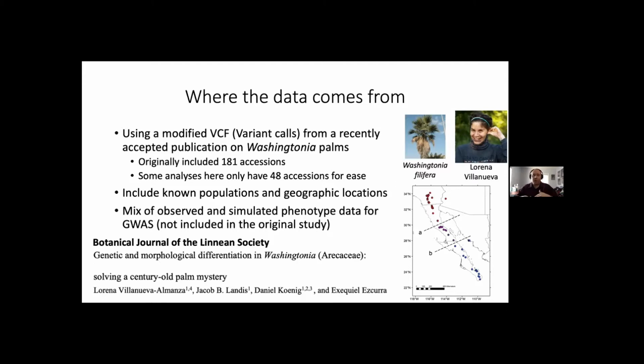Also, if you want to go grab the raw data that's associated with this paper, the links are in there as well. So that's the setup of what we're gonna be doing. We have the data, we have our platform. Now let's jump into doing some actual work here.